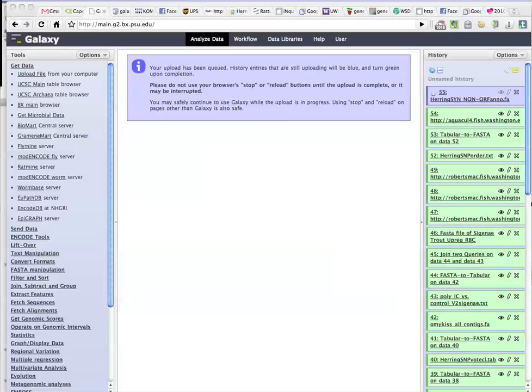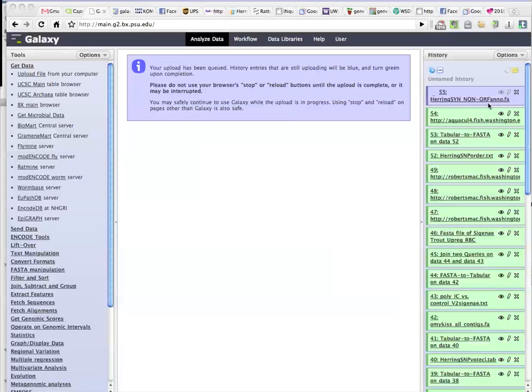The first step being you take the FASTA file of the consensus that was used for the mapping and the SNP detection. See here I'm going to upload it, and then convert it to a tab delimited file. So we'll have the sequence name and the actual sequence, and then go ahead and upload a second file.